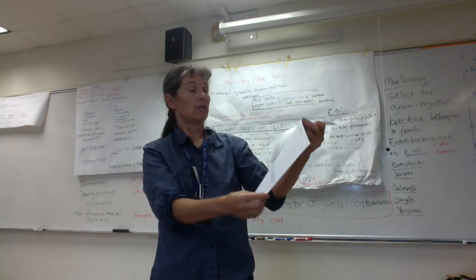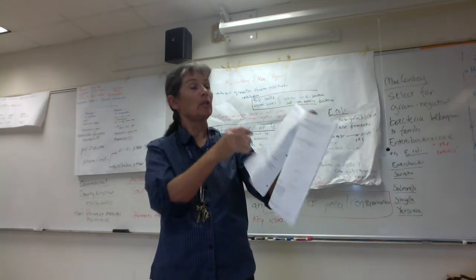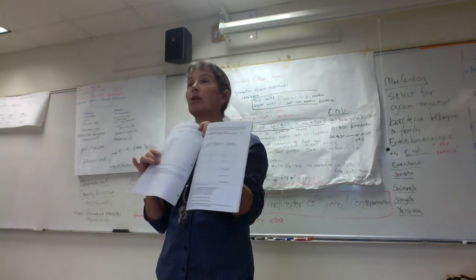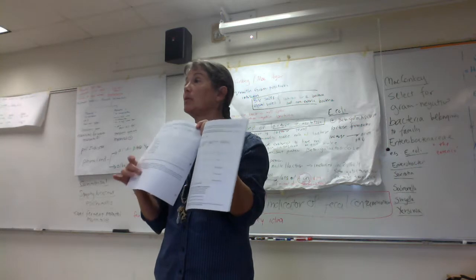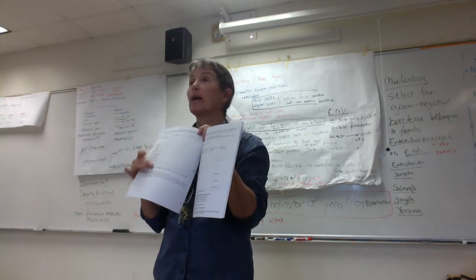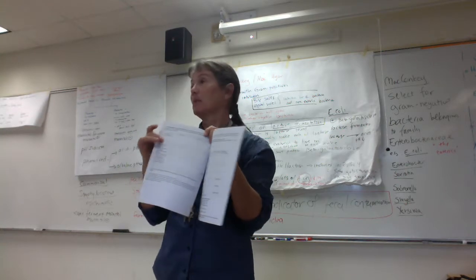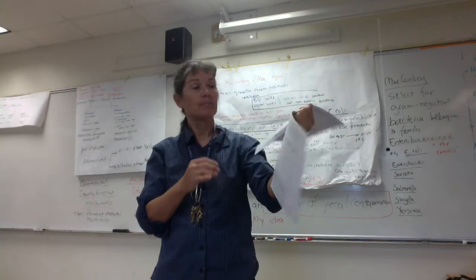You go page 2, page 3. On page 4, you guys, the colony descriptions, we're going to pull our airborne plates Tuesday. And we're going to have you describe 2 of the colonies on your airborne plates, and we're going to learn all the different descriptive terms we use for that. So we'll do this next week on Tuesday.